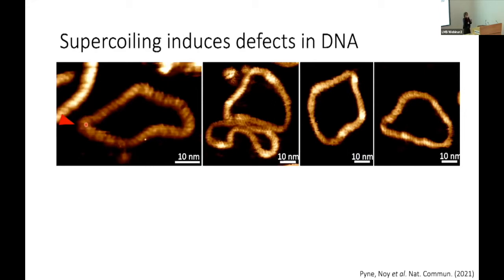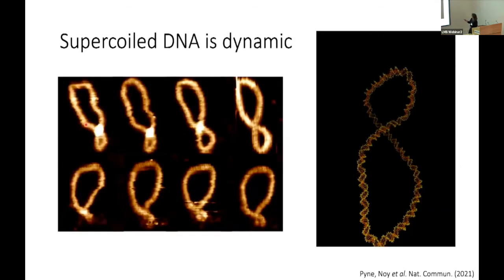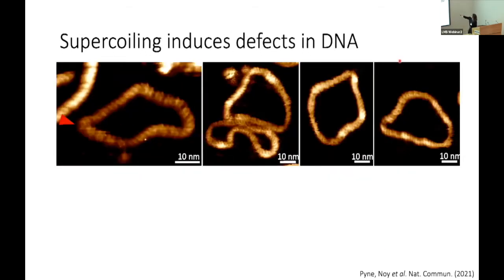And the base stacking isn't able to accommodate a change like this in helical structure. It just doesn't happen. So what that means is round that corner, our resolution has allowed us to identify that we have a defect there in structure. The other thing we're able to do, wrong button, is see areas where we have two single strands of DNA.